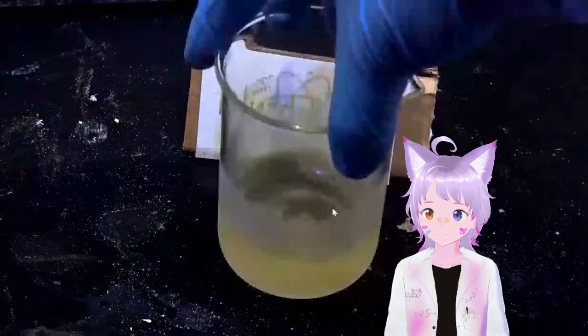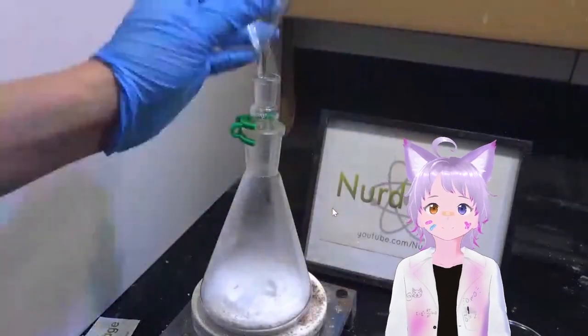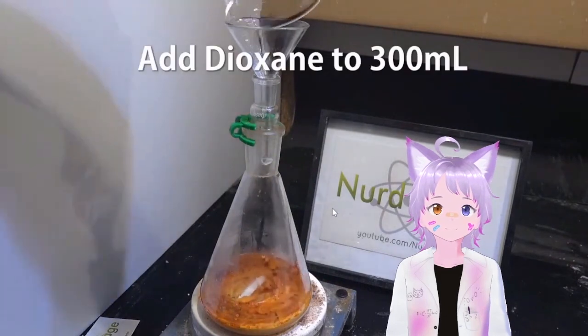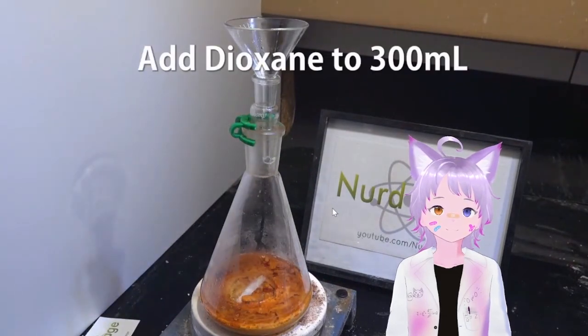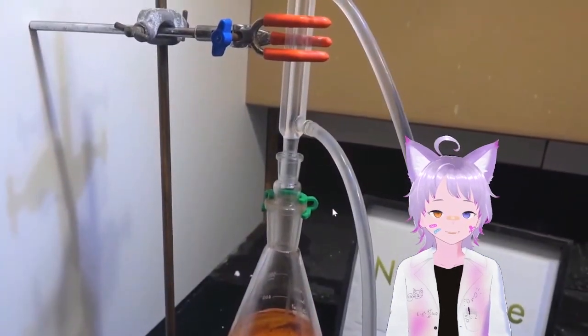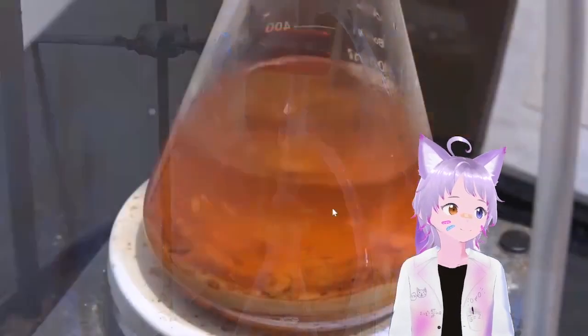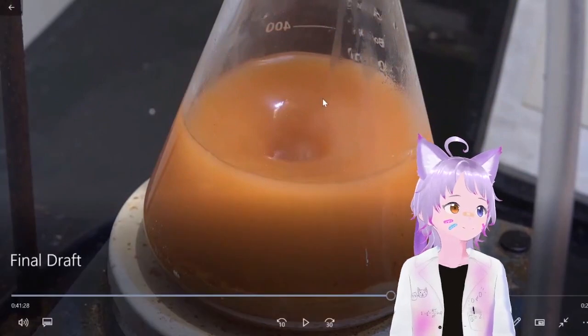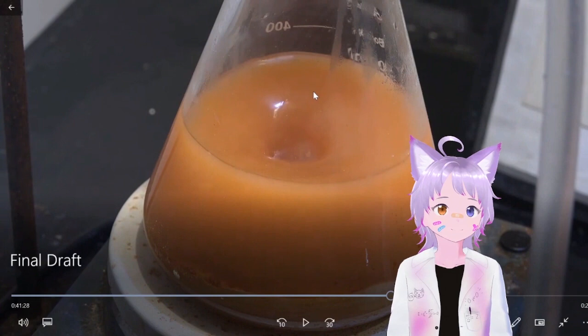Shake it up until everything is dissolved. Now, with the sodium methoxide, add the reagents. Now, add enough dioxane so the total volume is about 300 milliliters. Now, assemble. Yeah, that's an addition funnel moment. And I don't think he used any drying trap with these.